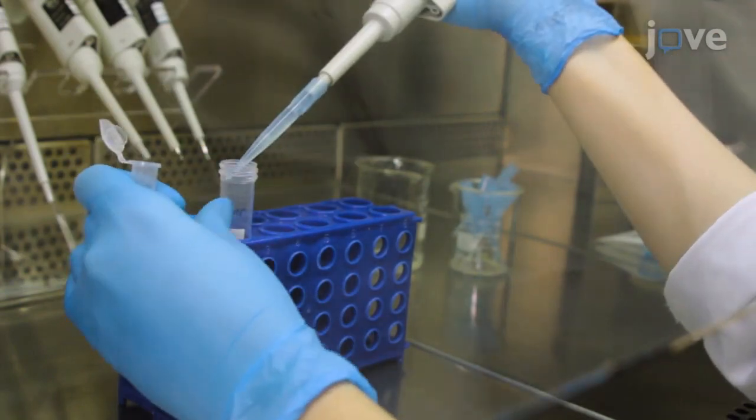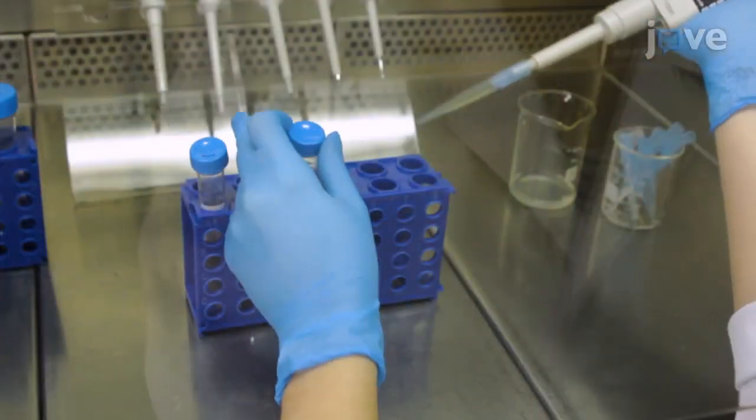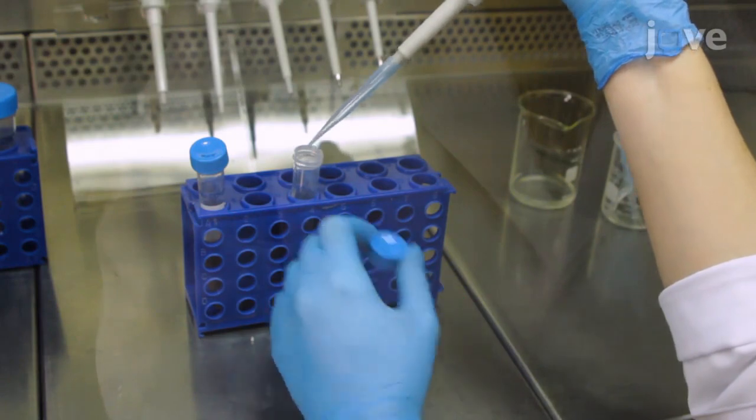Next, transfer the dissociated mixture to a 15 ml conical tube and add an equal volume of FBS to neutralize trypsin activity.